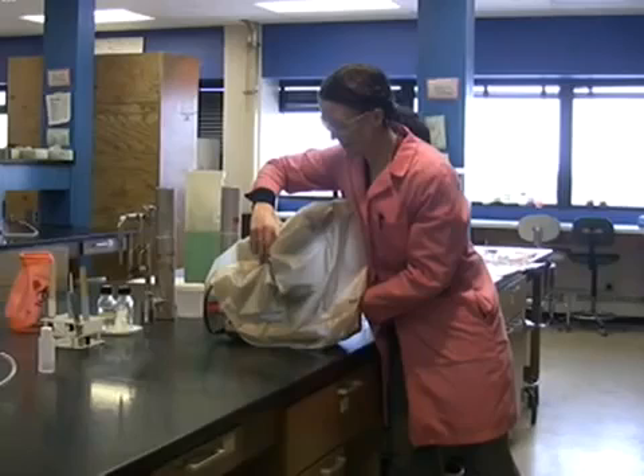The microscopes that we use are worth more than $2,000 a piece, so it's very important to know how to care for and use your microscope.